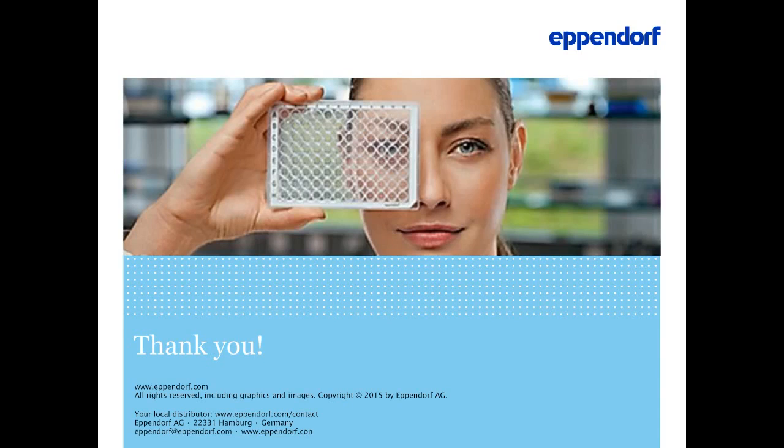Yeah, well, PS is polystyrene, PP is polypropylene, and chemically speaking they're completely different plastics. There are different sets of polymerization byproducts, which you will see, and also different additives used during the production process. So definitely, it's relevant. And from my perspective, PS is much less resistant to higher temperatures, so theoretically it might leach more than PP.